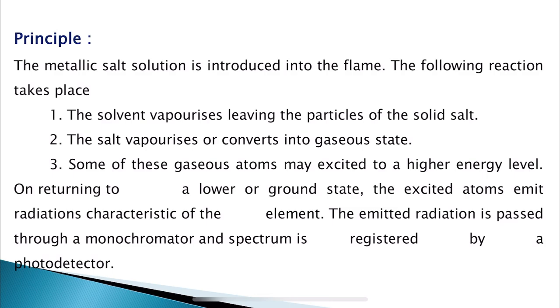Okay. So, that solid salt itself will be left once the solvent is vaporized. And the second reaction that is going to take place is, next, as the salt continues its contact with the flame, it is going to convert into a gaseous state. A salt which is in a solid state is going to get converted into a gaseous state. Next, some of these gaseous atoms may get excited to a higher energy level.